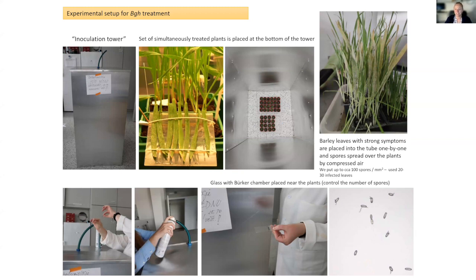Why am I talking about that in detail? To show you that the infection is very heterogeneous, and we are trying really hard, because if we want to assess the physiology of the disease, we need to ensure that the spores are distributed as homogeneously as possible.